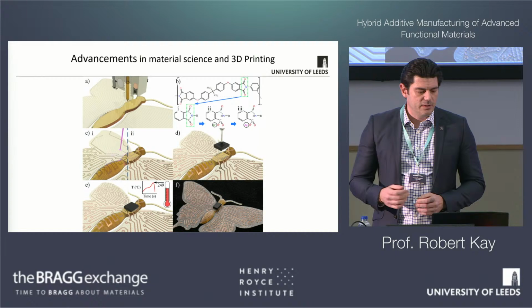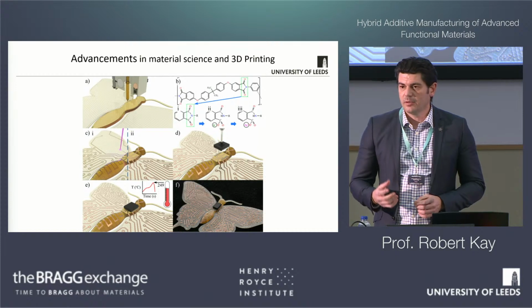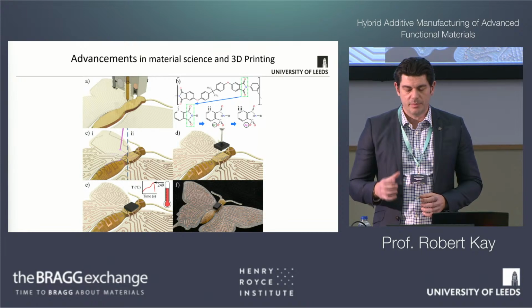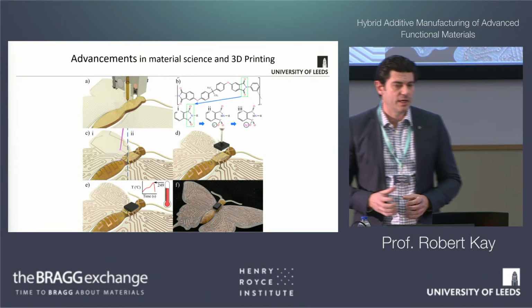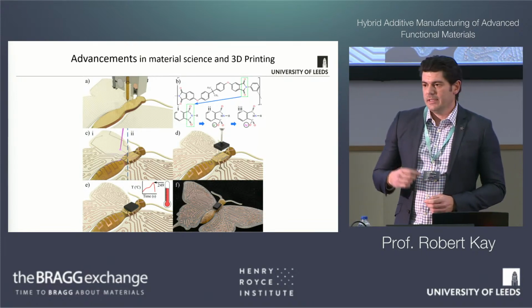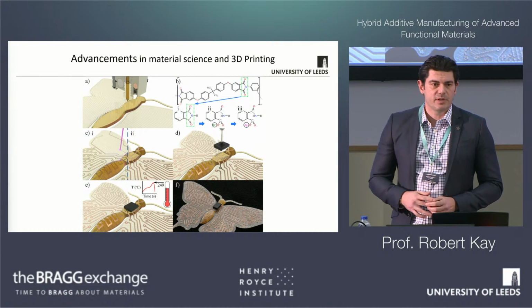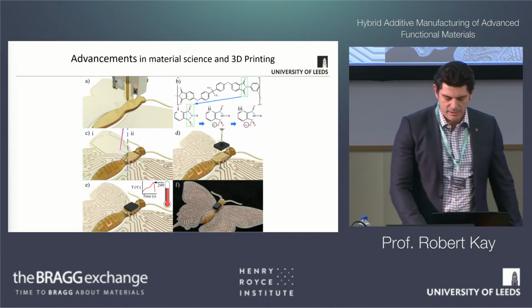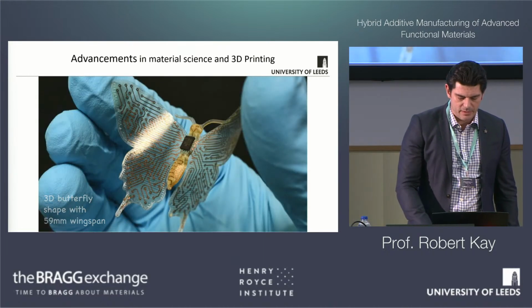The next thing we do is dip the printed substrate into potassium hydroxide, which cleaves the imide ring and leaves a potassium ion within that functional imide group. Then we dip this into another beaker of silver nitrate solution, and that creates an ion exchange. So suddenly we had silver ions embedded within this part.